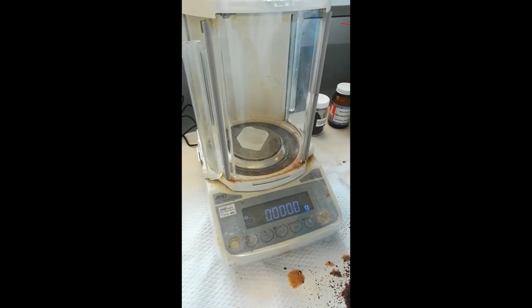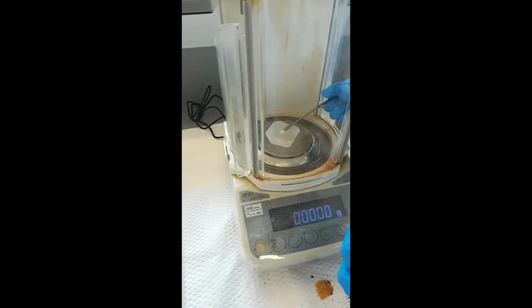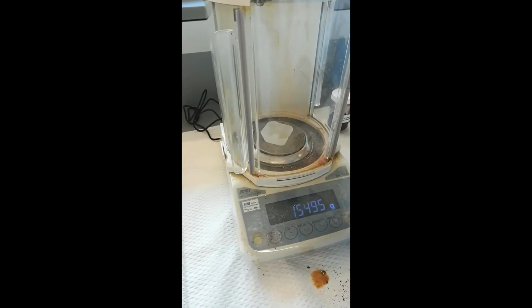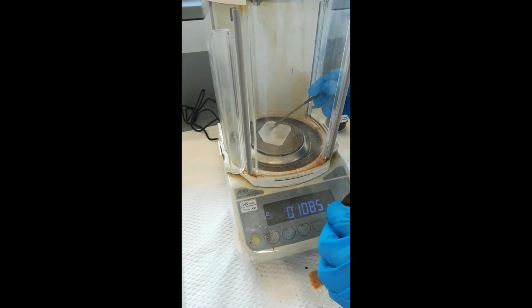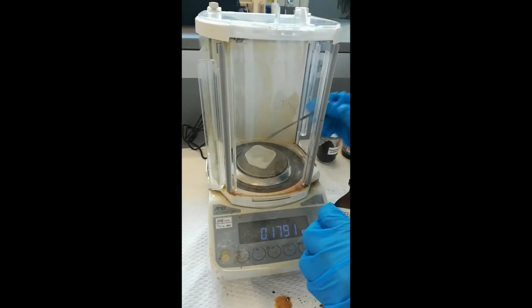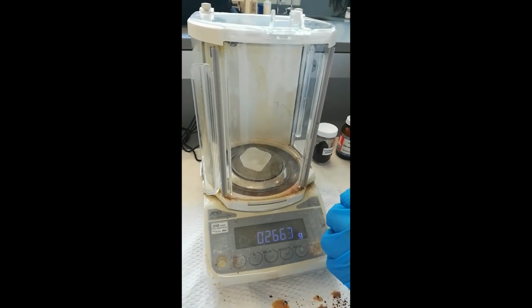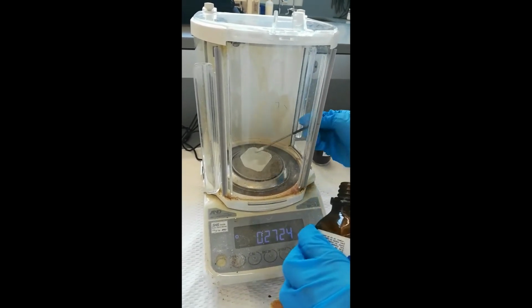While the salicylamide is being stirred in the round bottom flask along with absolute ethanol, we weigh out around 0.30 grams of sodium iodide powder. And this will be one of the reagents for this reaction.